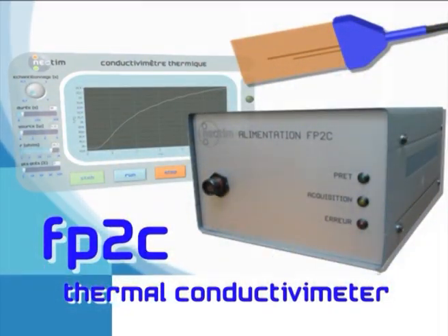The FP2C is a device for measuring the thermal conductivity of solid, pasty or gel materials.